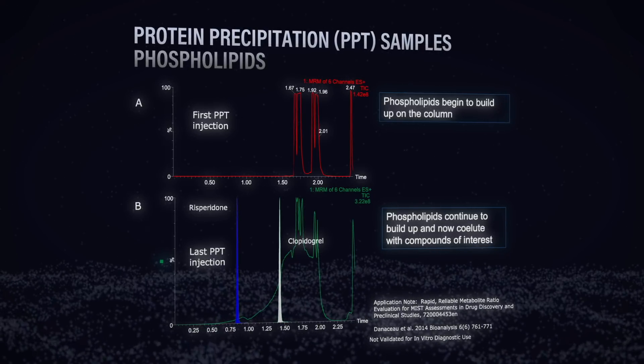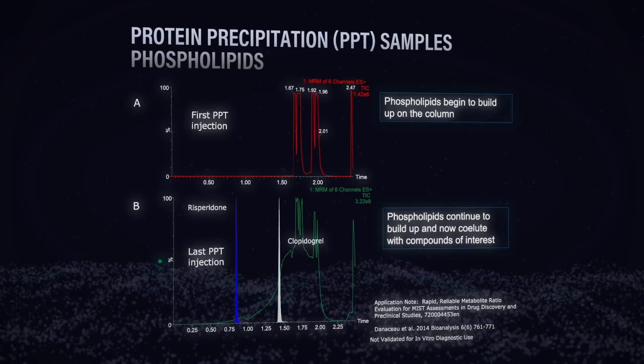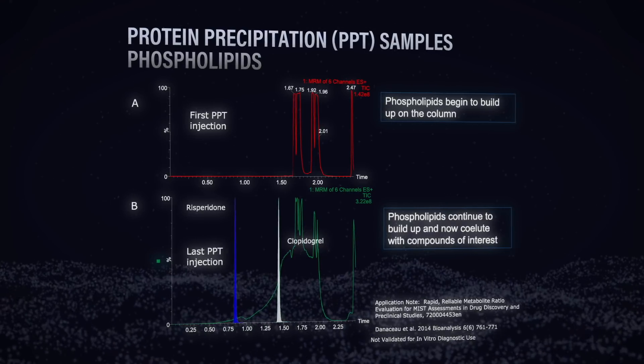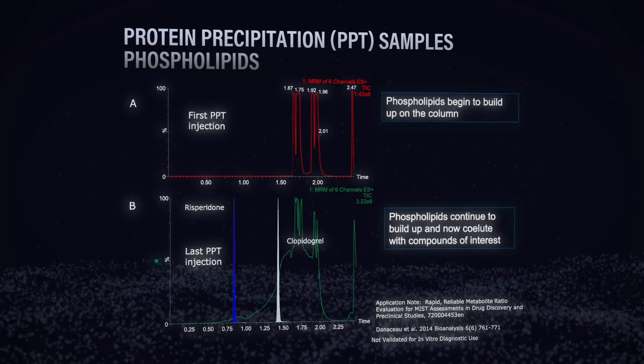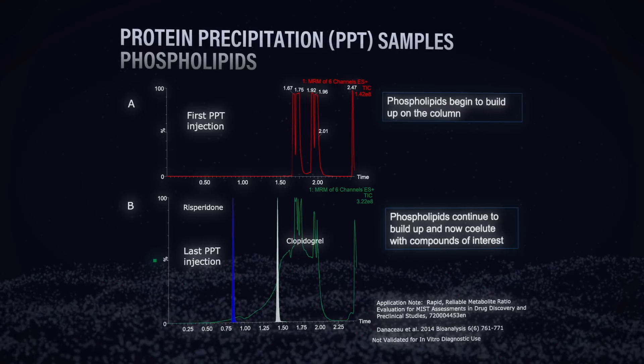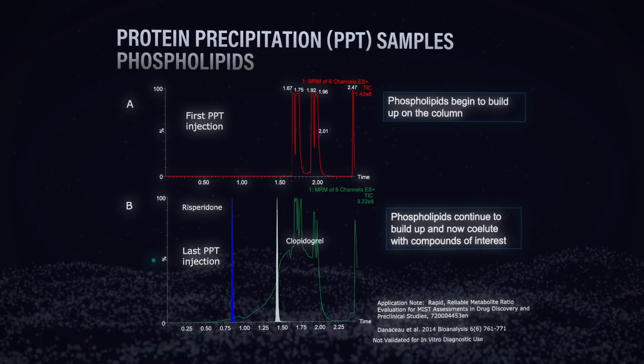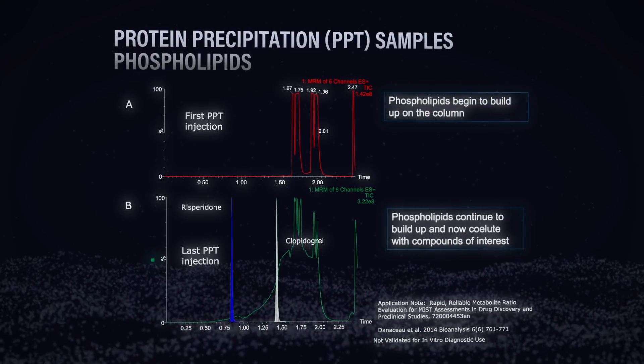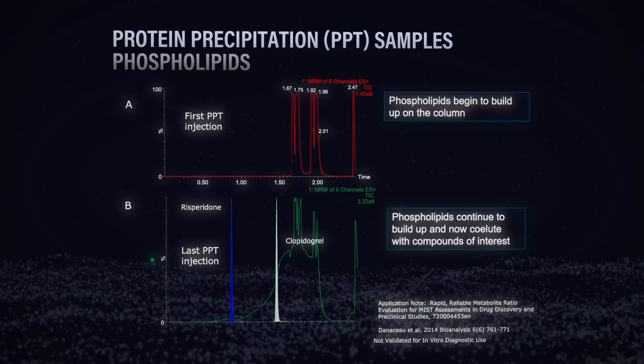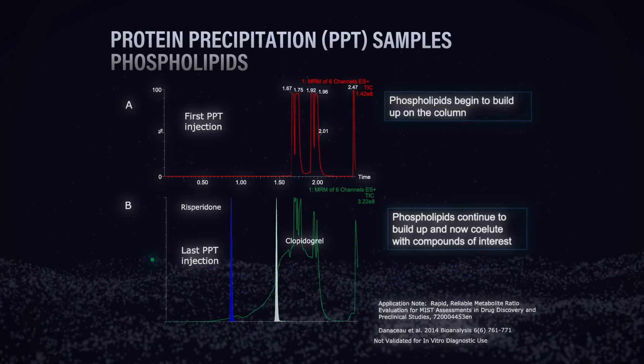So protein precipitation just isn't good enough to clean up these biological samples. Unfortunately it's not — it's easy, and sometimes we scientists like to do the easiest thing, but in this case it's really not getting us where we need to go. I think we have to call it busted, because protein precipitation really isn't enough to ensure good, reproducible quantification.